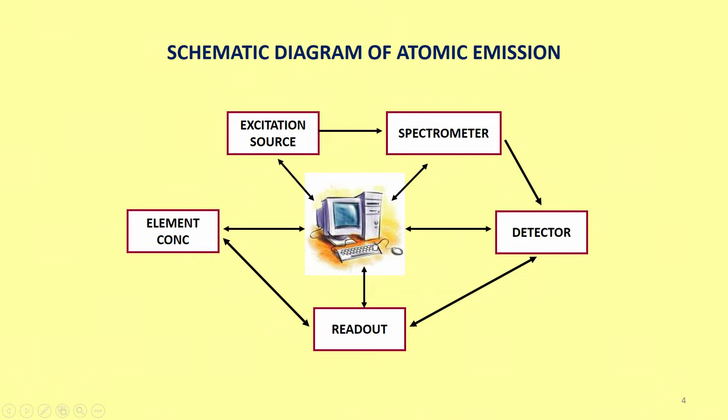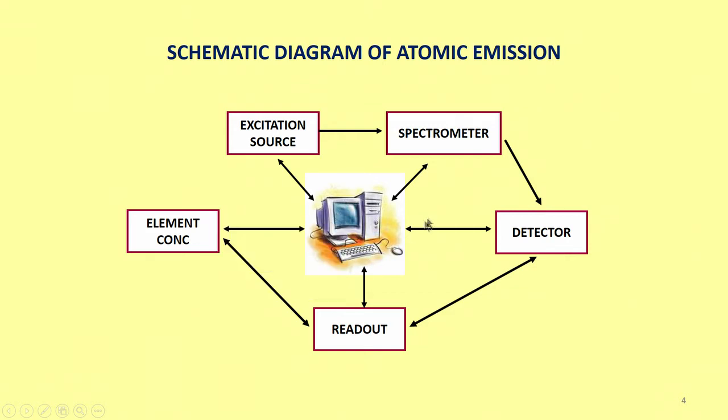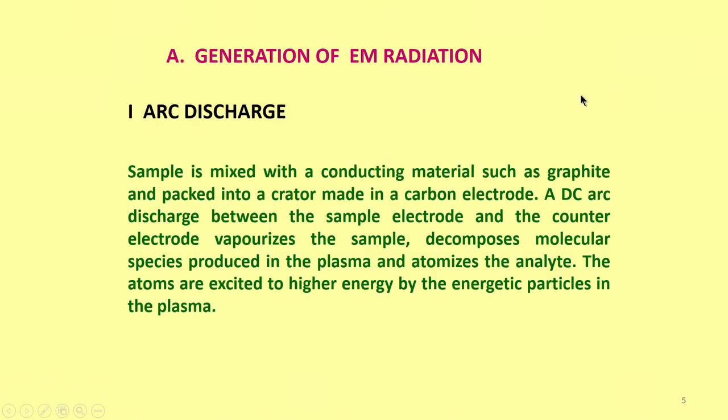The same computer will also give you the readout, and from the computer it again calculates the concentration of the sample. So, the whole schematic arrangement of the atomic emission is done here in one system.